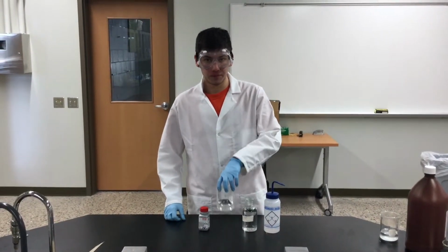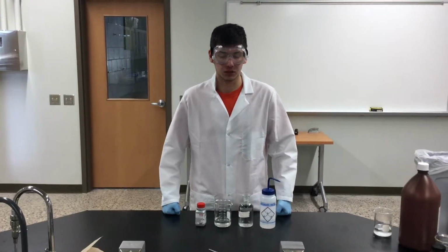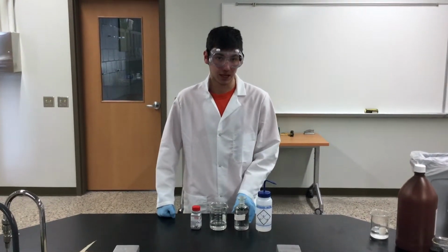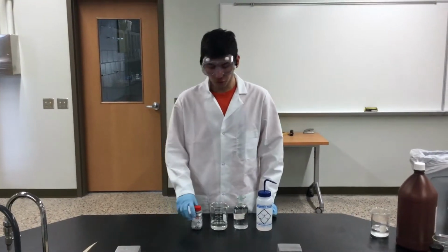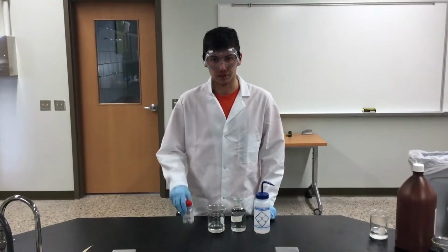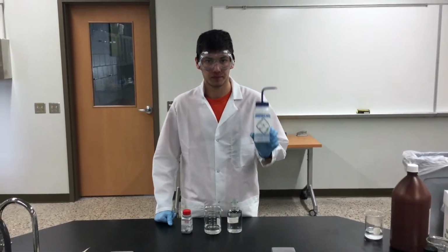This is solution B. It is an acidified 0.2 molar potassium iodide solution. The solution contains 10 milliliters of 1 molar sulfuric acid, 4.3 grams of potassium iodide. All of this is diluted to 100 milliliters with deionized water.